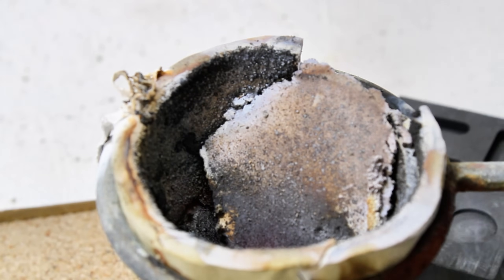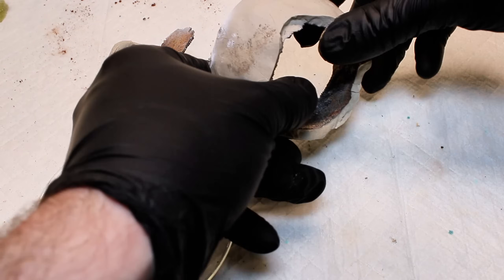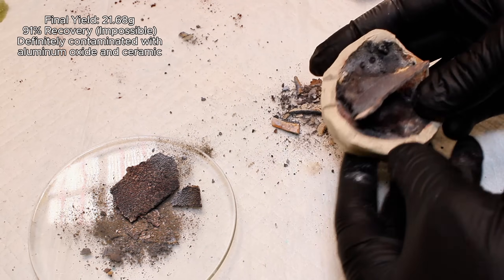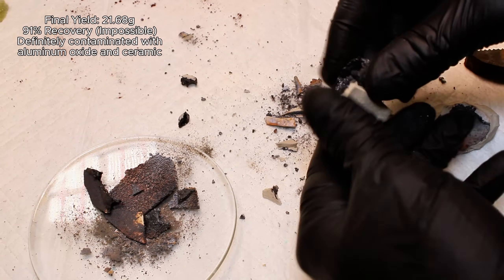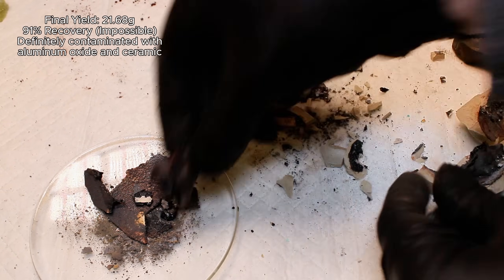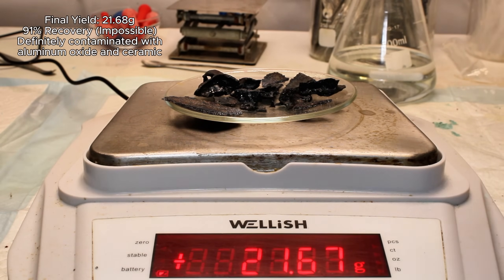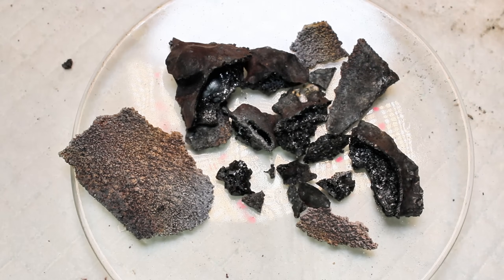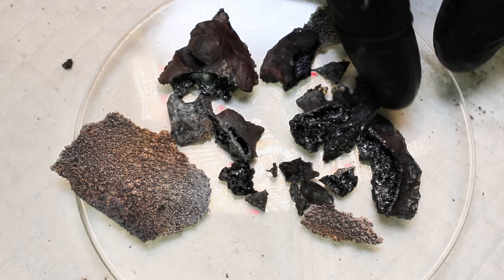Once this was allowed to cool for a while, I got to work separating my pure iron from the ceramic dish, which was easy because it crumbled to dust after exposure to such incredible heat. In the end, I got a final mass of 21.68 grams, which would represent a 91% recovery from my iron supplement pills. Obviously, this is impossible given my 83.4% yield earlier, and the extra mass is likely aluminum oxide and bits of ceramic that fused to the metal. Regardless, this is about as pure as it's going to get, and in the end, I consider this project a success for being the most scientifically impractical way possible to obtain iron. It was a lot of fun to trial and error my way to pure iron from supplement pills, and I do like the way iron produced using thermite looks.